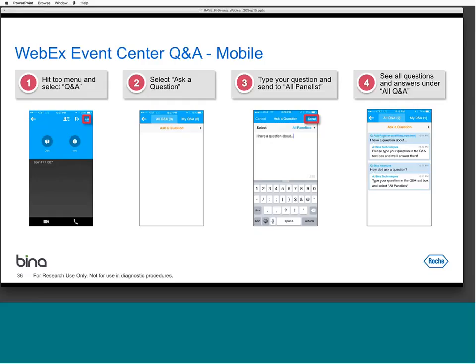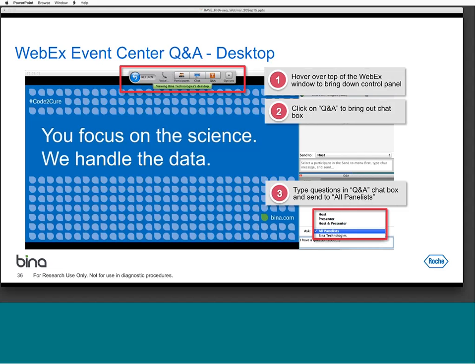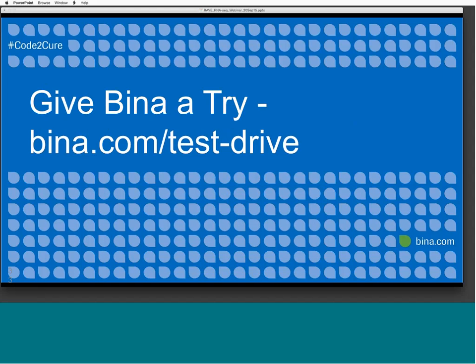Okay, so I'll answer some of these questions here. I have a question here: if the genome of a particular species is non-existent, then is alignment impossible? Well, yes. So the RNA-Seq workflow that we have described, where we align to a reference genome, that would not be possible. However, it is possible to do de novo assembly of the transcriptome using tools such as Trans-ABySS and similar tools. And this is currently not supported under Bina RAVE, but it's something that we are definitely looking into.